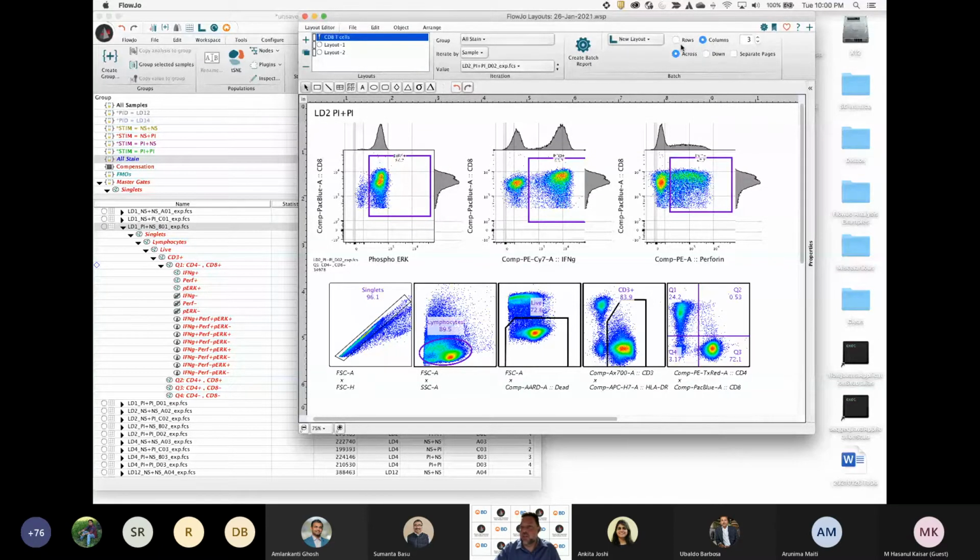And so what this is saying is I want to go through my group of 20 samples and to go down or across and create 3 columns. So how about I've got 5 patients, I'm going to go down and create 5 columns. So what this will end up being is 5 groups of patients, 5 columns that are going down. So sample 1, 2, 3, 4.